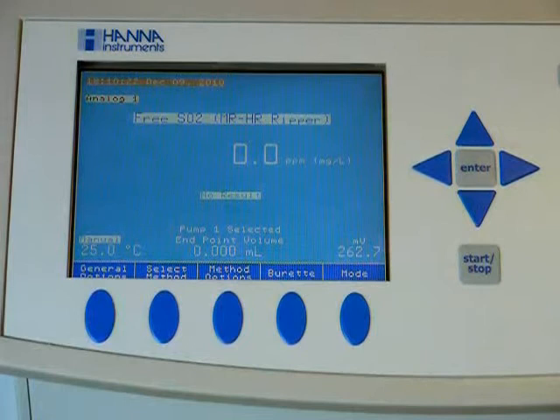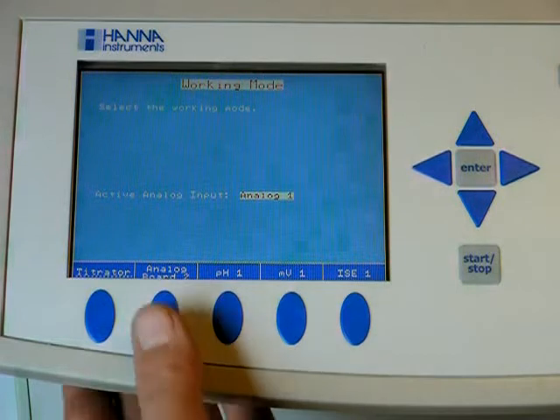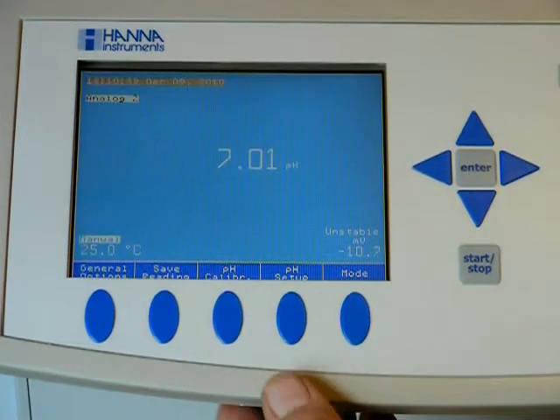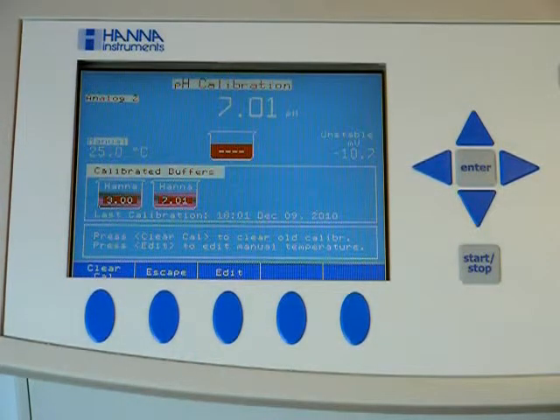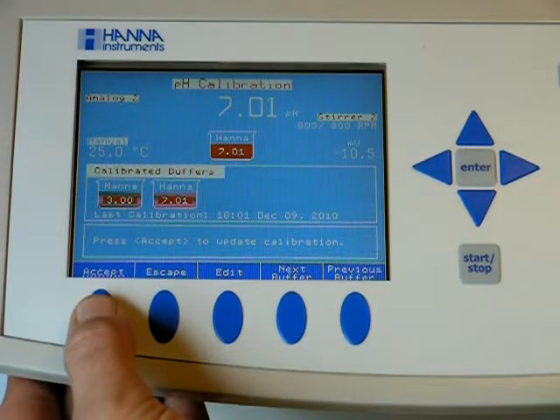Now that we have our probe in the 7.01 solution, we will enter the pH menu and pH setup. Choose your mode — my probe is hooked up to analog board 2, so we want pH and pH calibration. Turn on the stir feature. If this was a new probe, we'd press clear. Otherwise, we'll just wait for it to stabilize and accept.